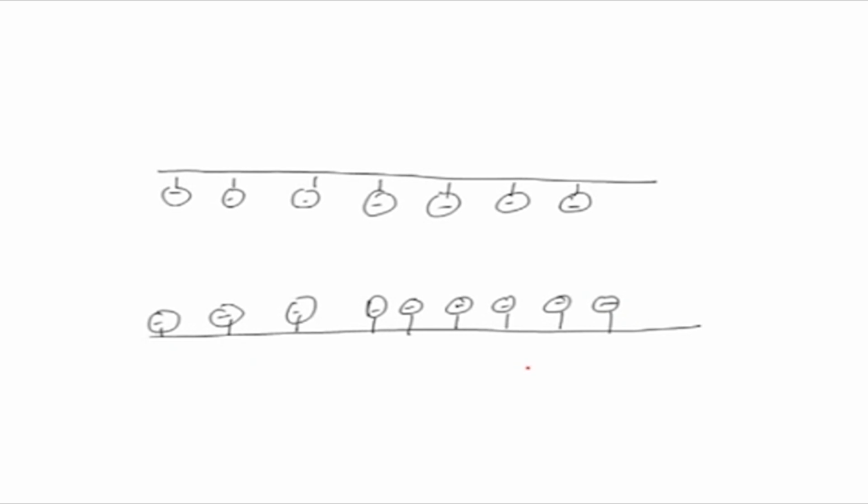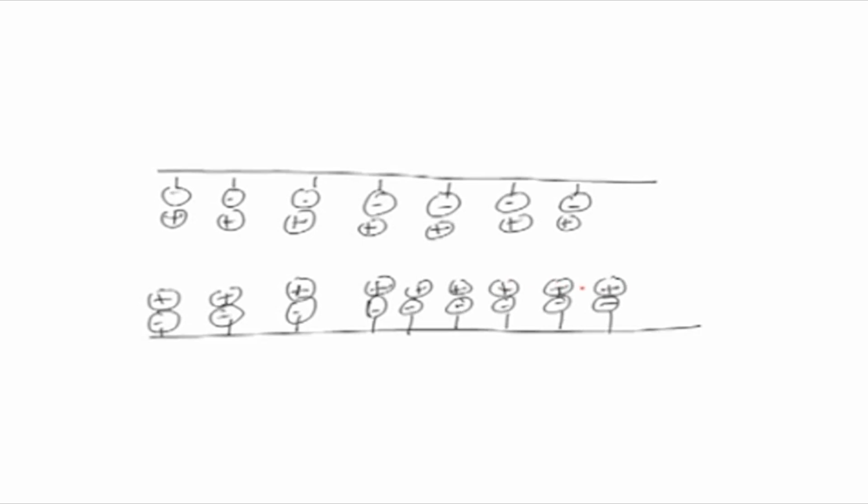Now, there is a particular electrolyte in the capillary, like if you say it is a free solution you are utilizing here, then that particular solution inside this capillary will carry both positive and negative charge. Now, what will happen? This positive charge will be attracted towards the negative charge here. So what you are going to see, on the inner side of the wall, is a layer being created, which we call a double layer of negative and positive charge.